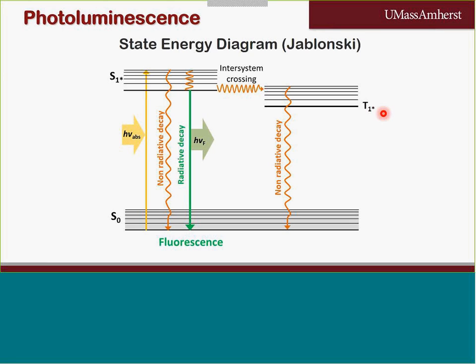What happens with the emission of a photon is called phosphorescence. So basically, we have two processes that we are exploiting in these optical techniques: fluorescence and phosphorescent emission. The alternative decay, radiative or non-radiative pathway, is what determines the environmental sensitivity of this probe.